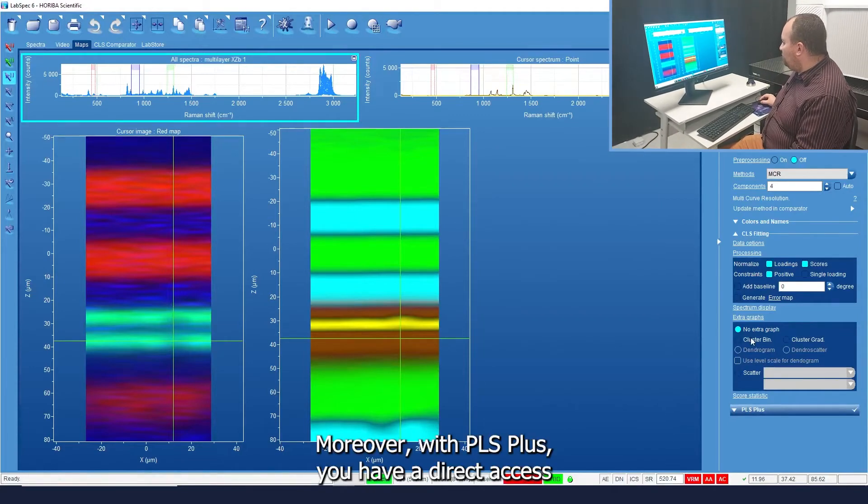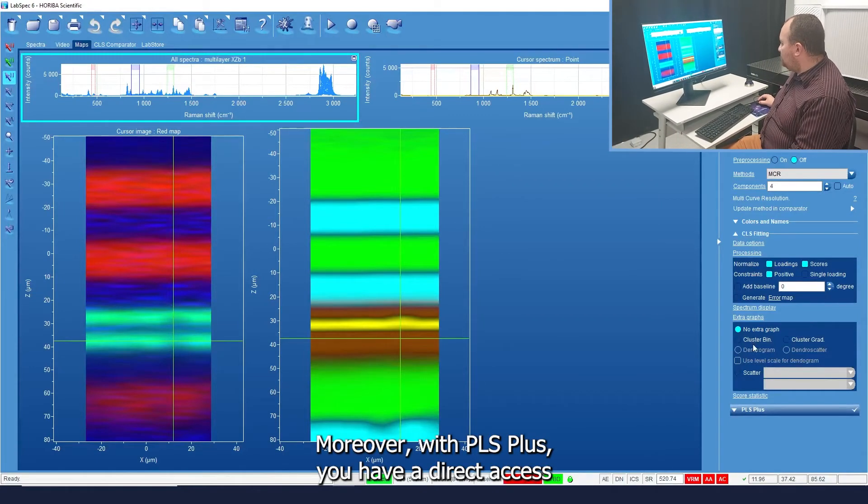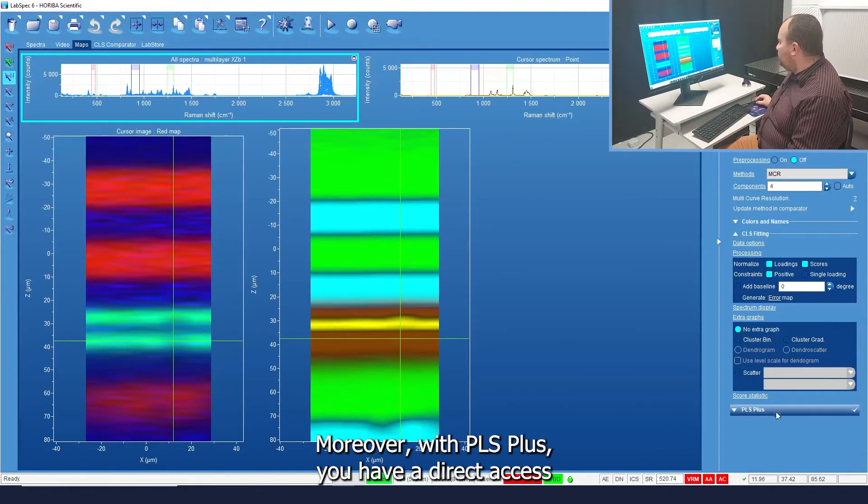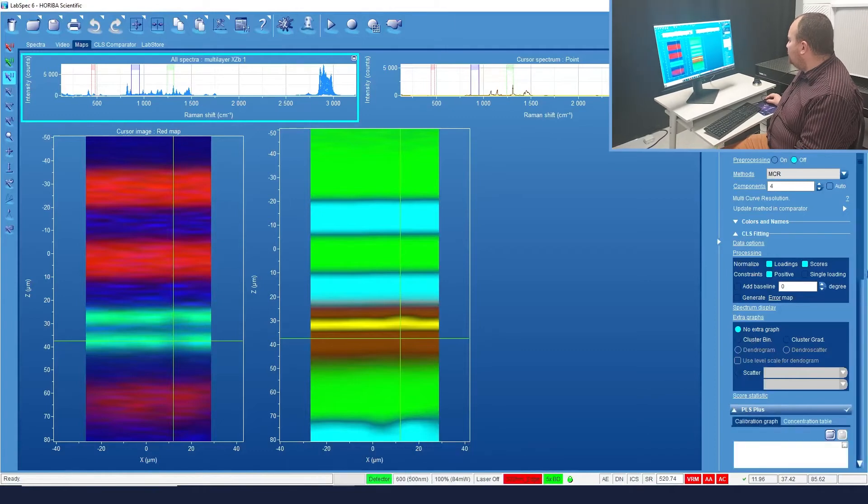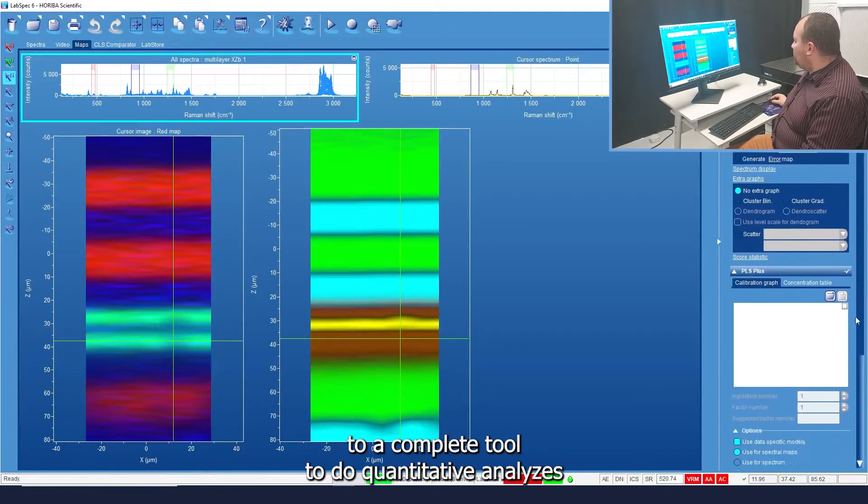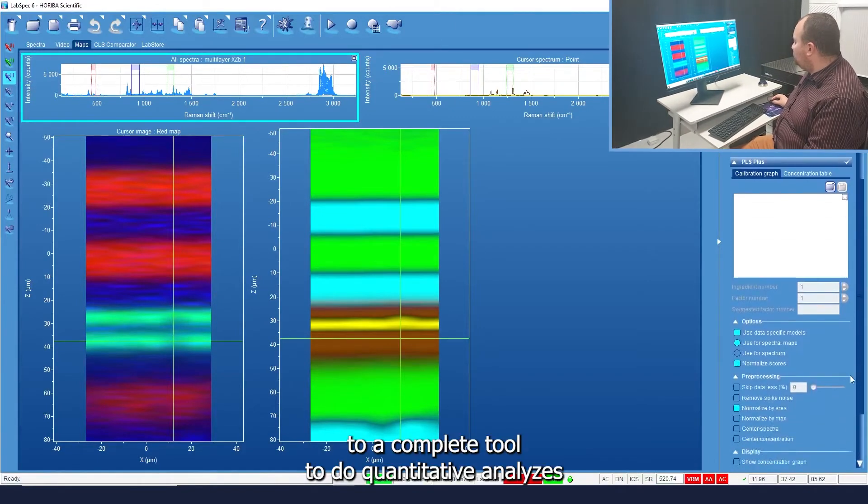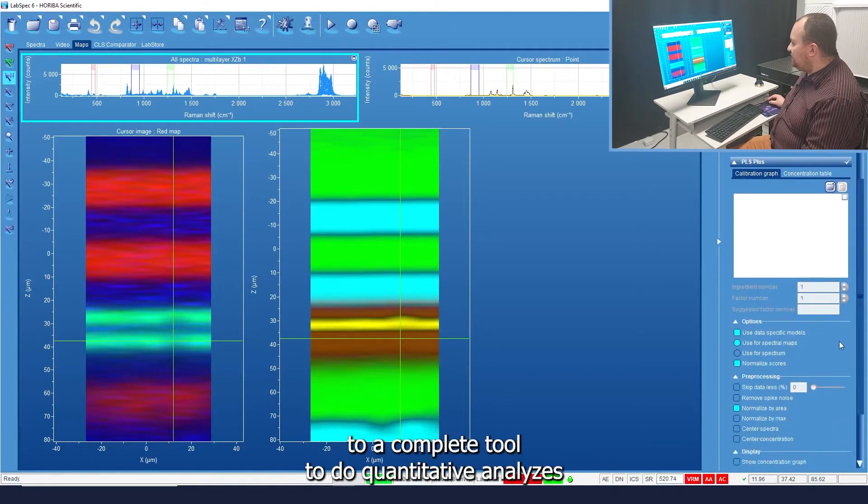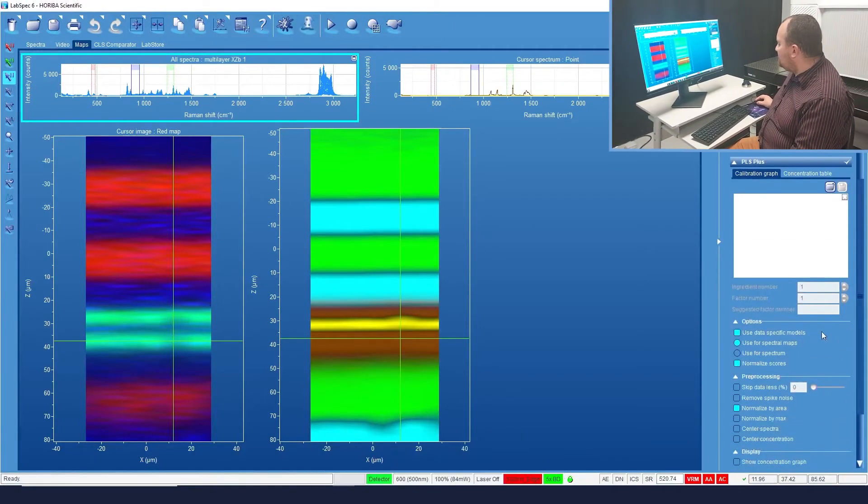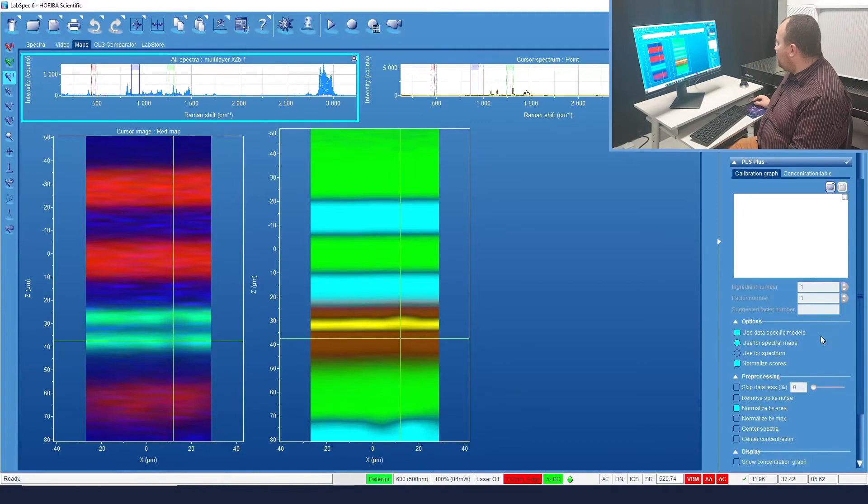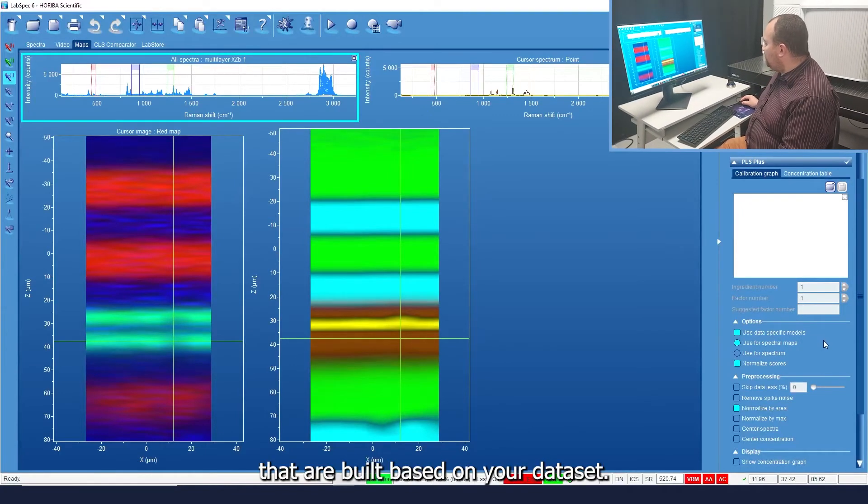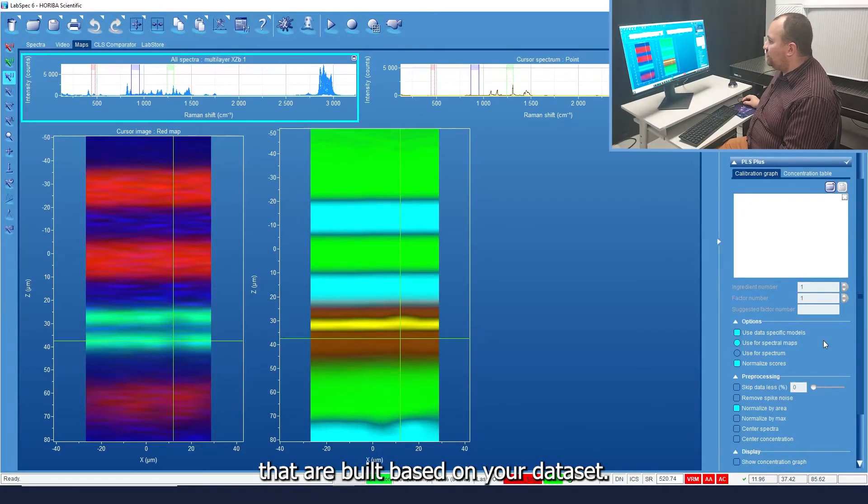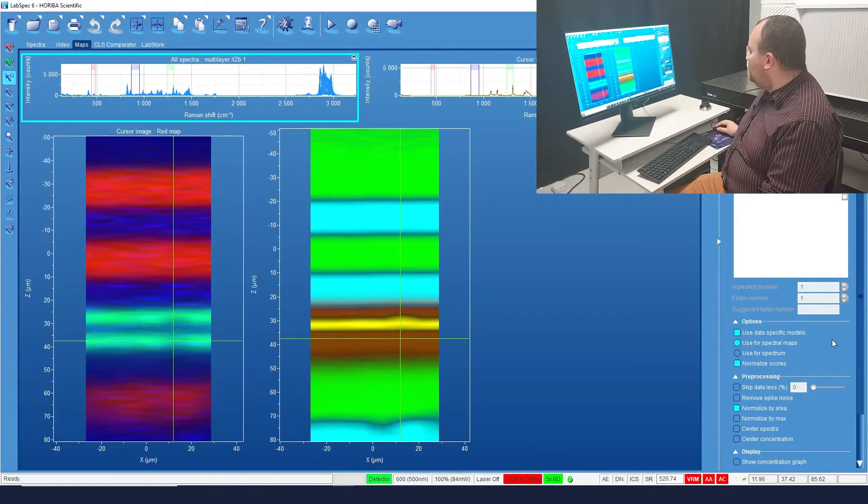Moreover, with PLS Plus, you have direct access to a complete tool to do quantitative analysis based on models of calibration that are built based on your data set.